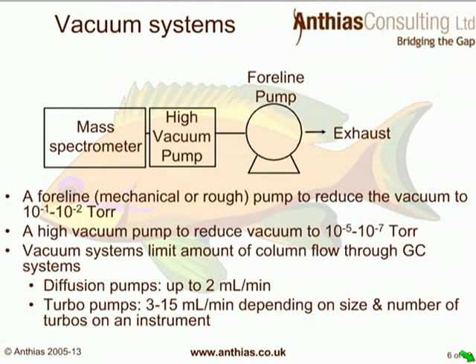So knowing what system you have, knowing how high a flow rate you can use is very important when setting up your GC method, just to make sure we maintain a good vacuum and therefore good sensitivity.